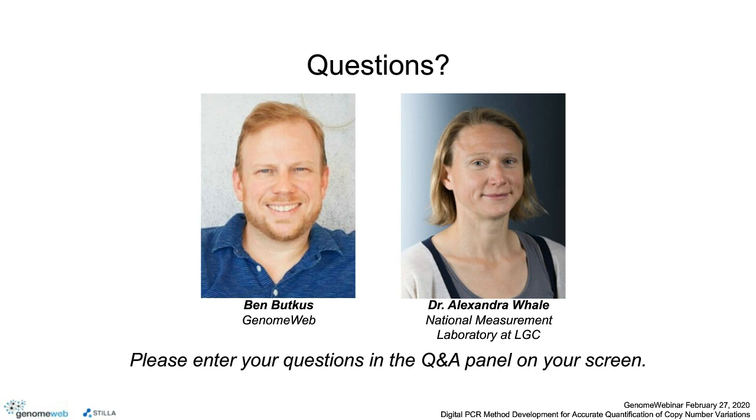Thank you. The next question is a two-part question. Could you please provide your opinion of single-cell sequencing versus digital PCR? And are there methods for transposase-accessible chromatin digital PCR or reverse transcriptase digital PCR for the transcriptome?